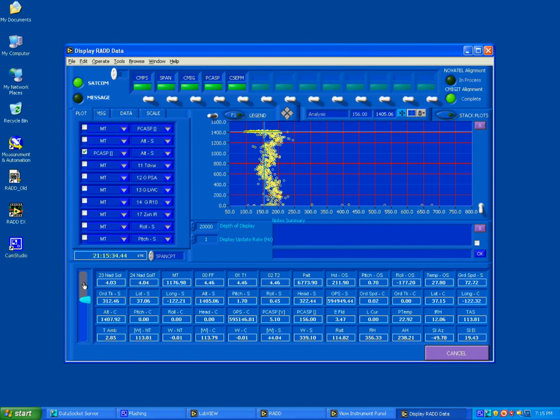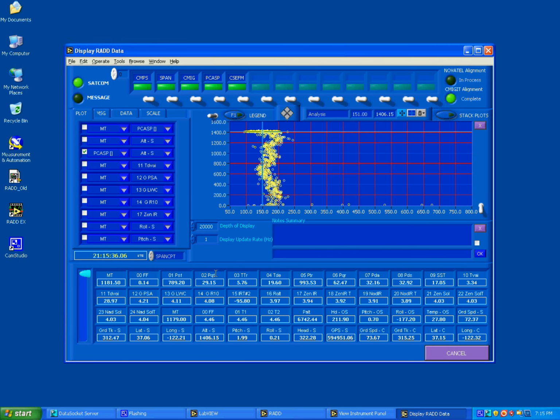The fields below the graph allow the onboard researcher to take notes. Note 1: Particle concentrations are low. Note 2: Will coordinate with the ship in 10 minutes. Each entry of the notes can be accepted by pressing the Enter key. Press the Tab key to enter a new entry.